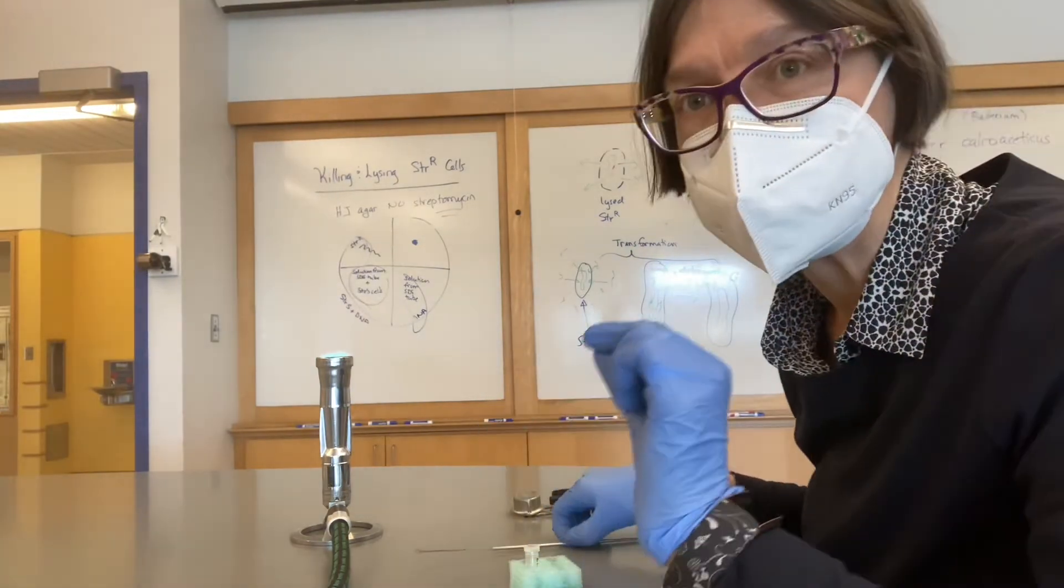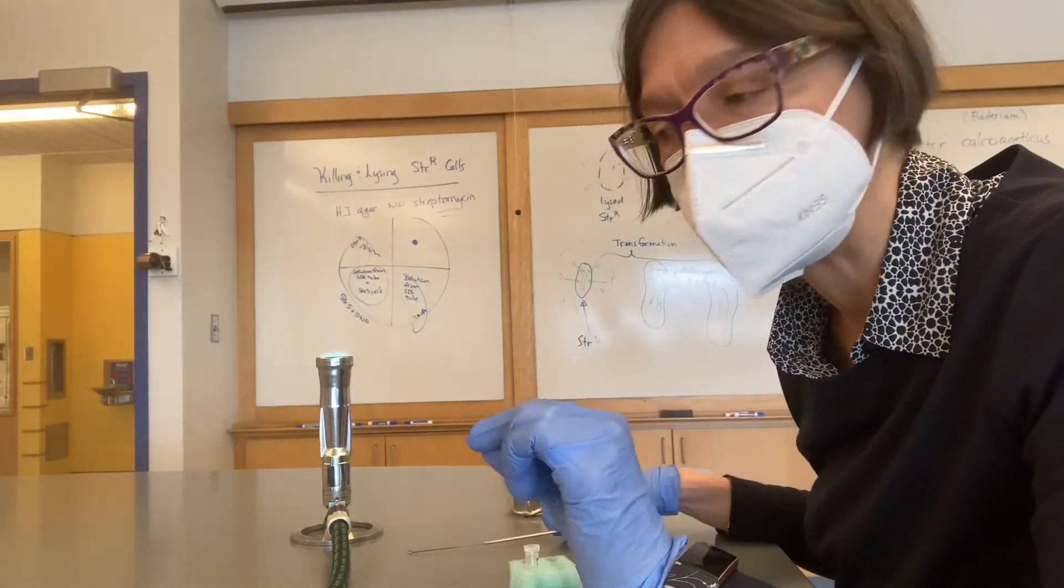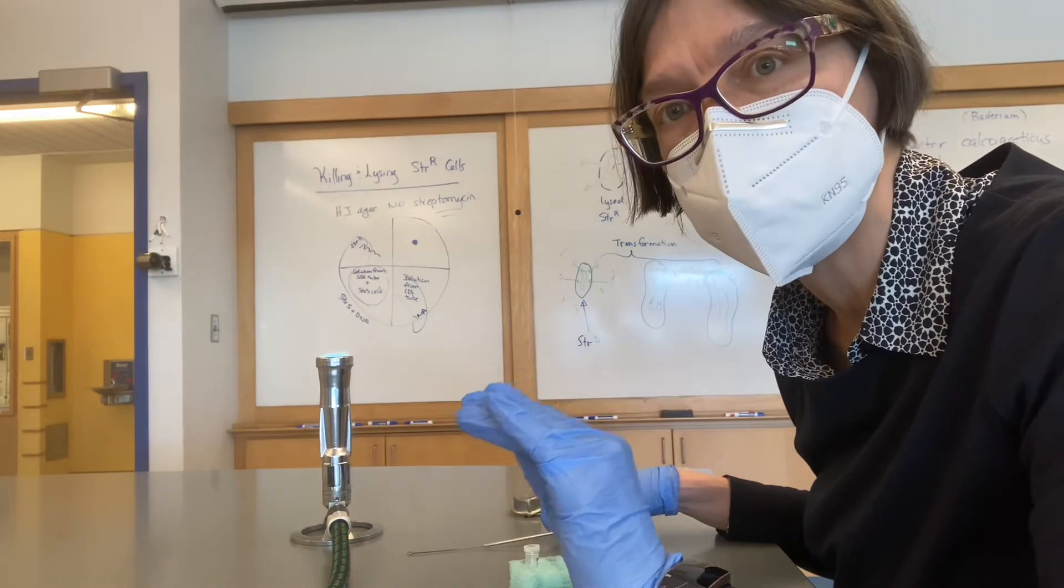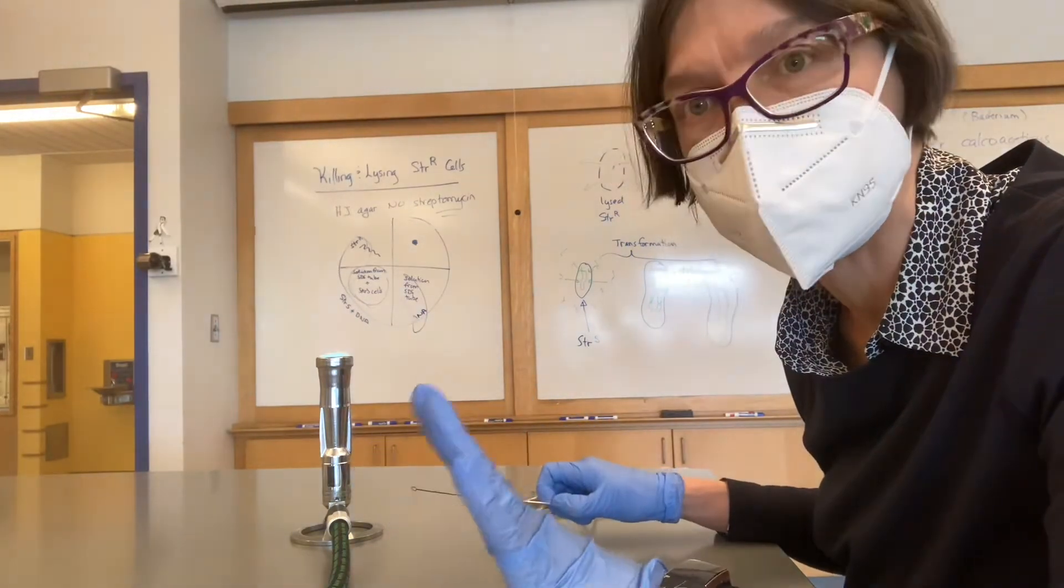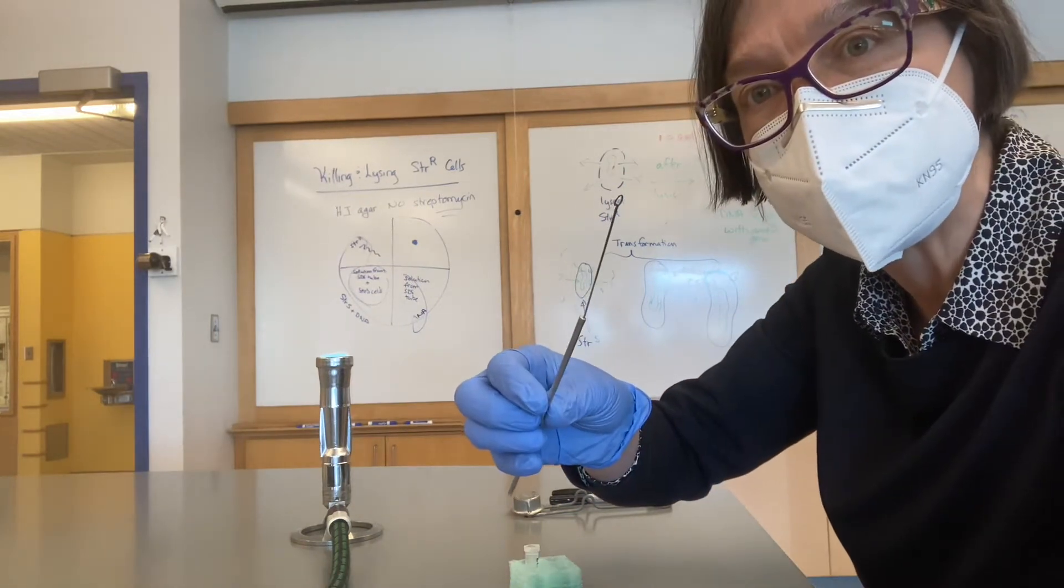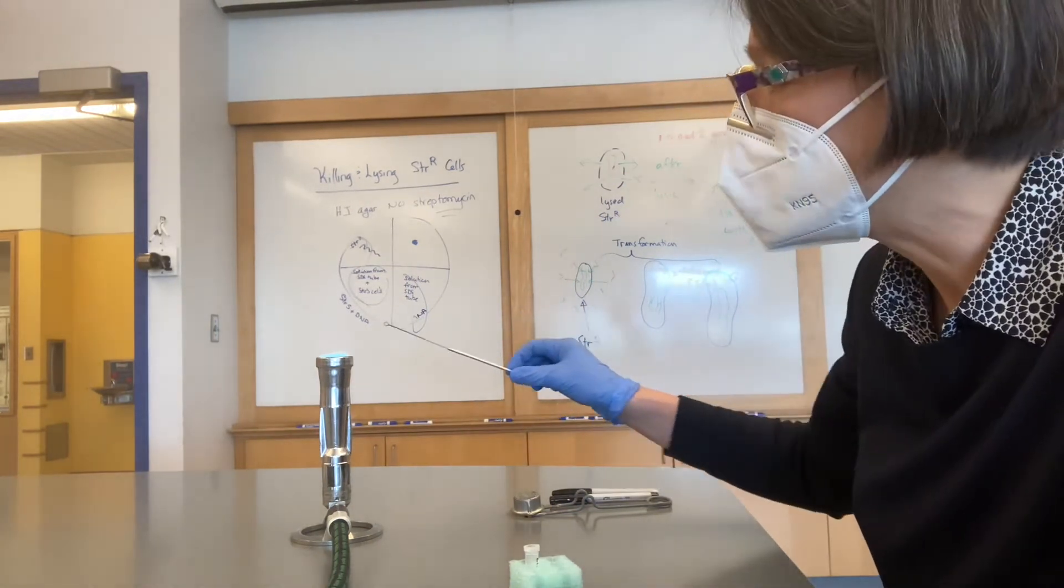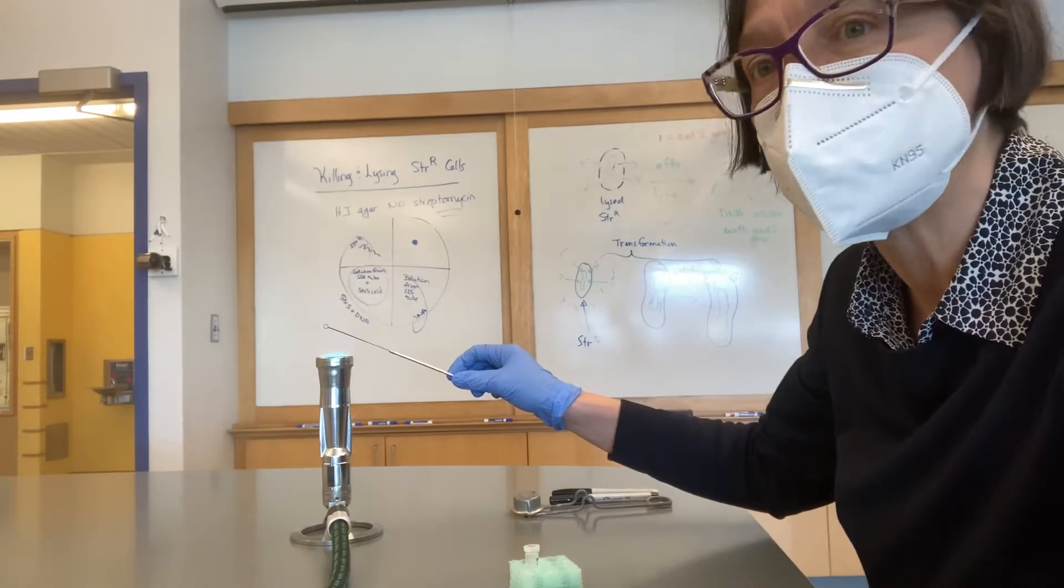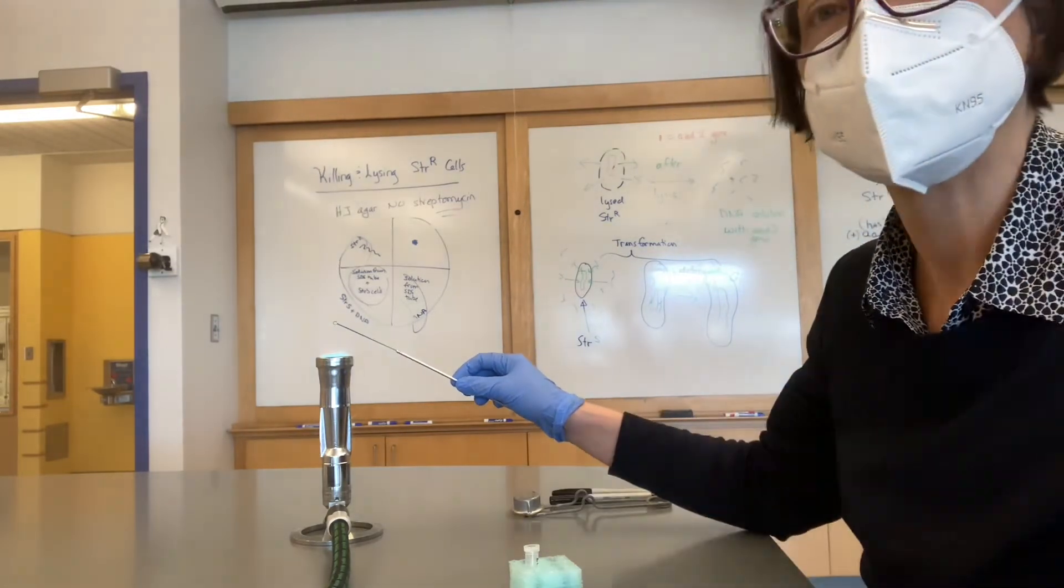This is so I can use aseptic technique, which means I'm not introducing any new organisms into anything at all, keeping things just as they are now. I'm going to flame my inoculating loop, which I do by holding it in the Bunsen burner until it is red hot.